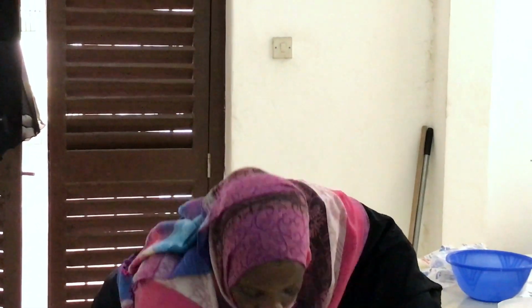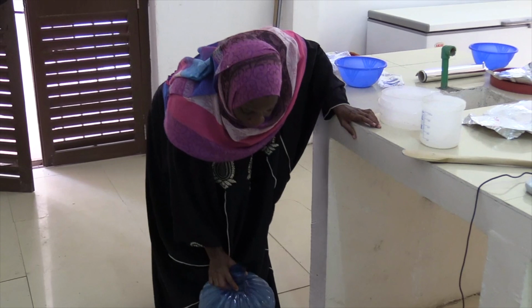And now we measure about 10 liters for our salt to make a saturated solution. We make 10 liters.